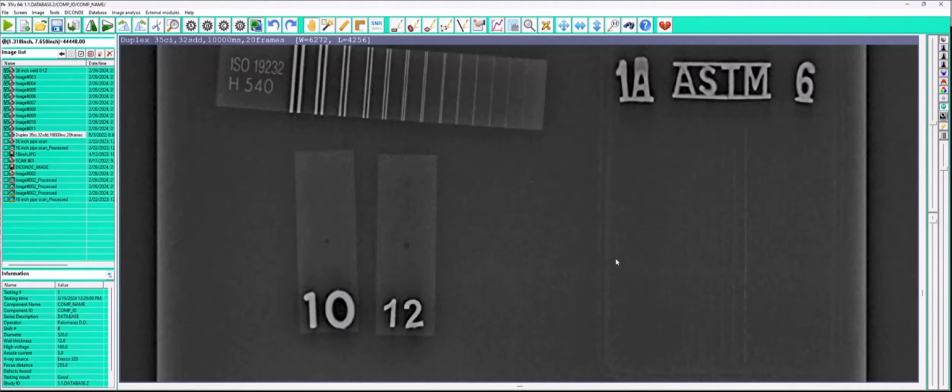So I could go back and say I've qualified the 140 micron panel for this thickness, and now I don't have to do that again. It's been qualified. That procedure is saved. That qualification is done. So you have hardware qualification, software qualification, and technique qualification. All of our tools assist in making those qualifications.